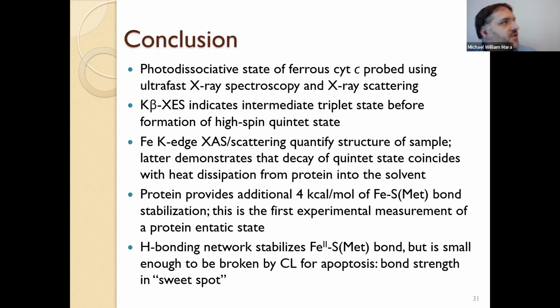I suppose cytochrome c itself is pretty easy as a protein. You can get a lot of it, and it's super pure. However, if you have a number of different proteins, you tend to get background signals sometimes in the iron K edge signals. In steady state measurements, this has messed up a lot of different structural assignments, and one of the ways they clear that up is actually using HERFD. So it could help you in more complicated proteins, certainly ones that have multiple metal centers, where it might give you some ability to be more selective. And certainly something like HERFD or RIXS, where you're pretty photon starved to begin with, could benefit in that regard.